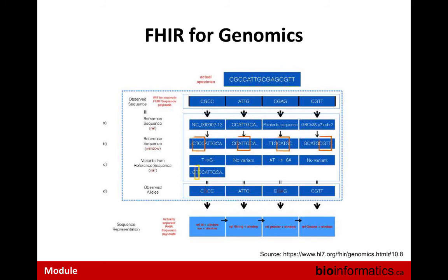It's still missing quite a lot. You can't capture the whole VCF file. You can't capture a whole BAM. And I think you'll notice, if you do any reading, or if you've worked with this data already, that you probably already had to reprocess files. Things are changing very quickly. You don't really want to necessarily permanently record one snippet from somebody's NGS result as being the permanent file.